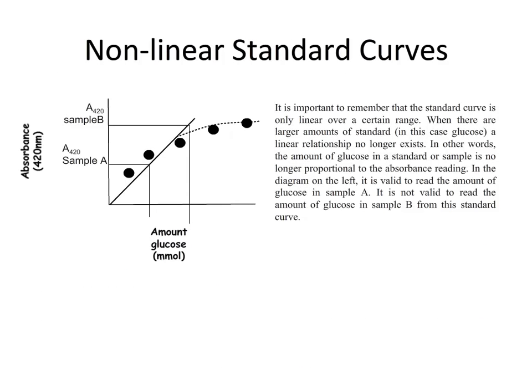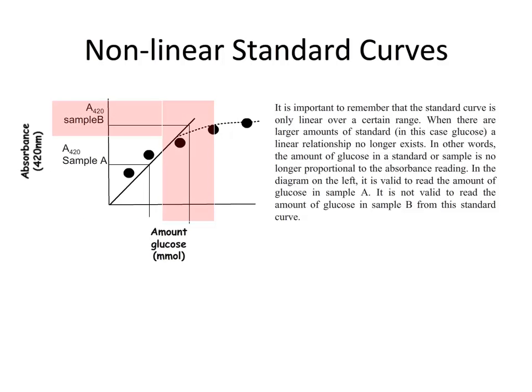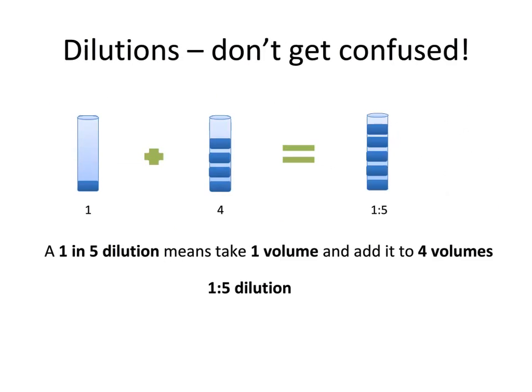At some concentrations, the relationship between absorbance and concentration ceases to be linear, so it is important to remember that the standard curve is only linear over a certain range. When there are larger amounts of standard — for example, when there is too much glucose — a linear relationship will cease to exist, and the amount of glucose in a standard is no longer proportional to the absorbance reading. In this diagram, it is valid to read the amount of glucose in sample A, which is at lower concentrations where the standard is linear, but it is not valid to read the concentration of glucose in sample B, as the standard curve in that section is no longer linear.